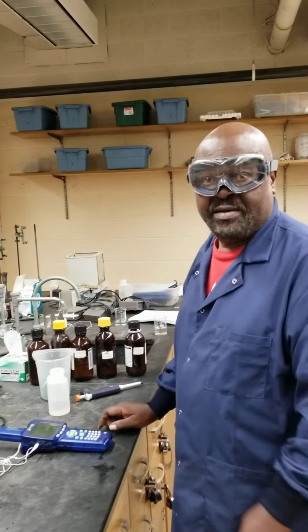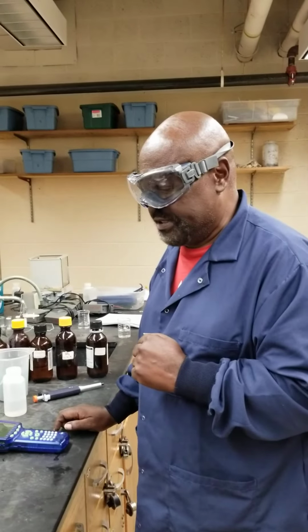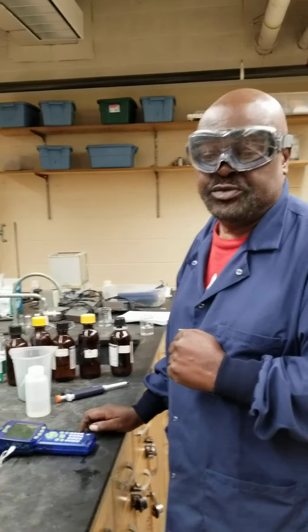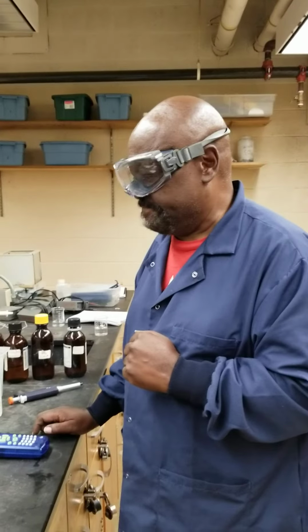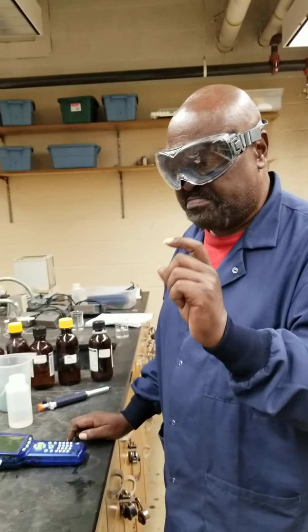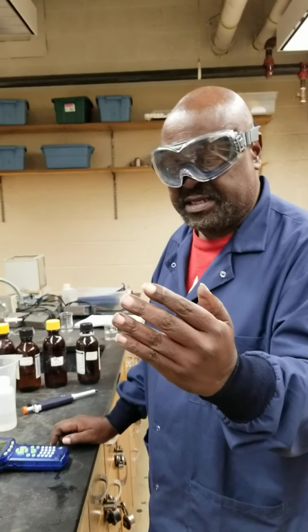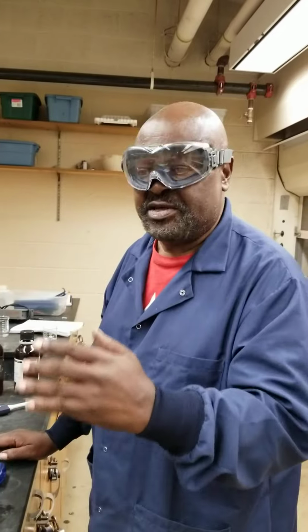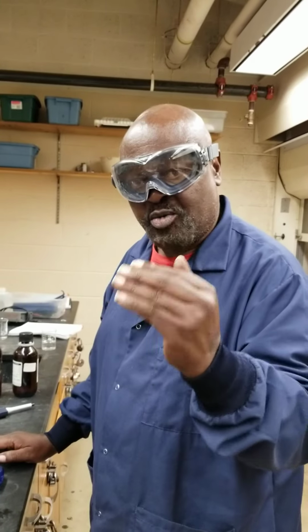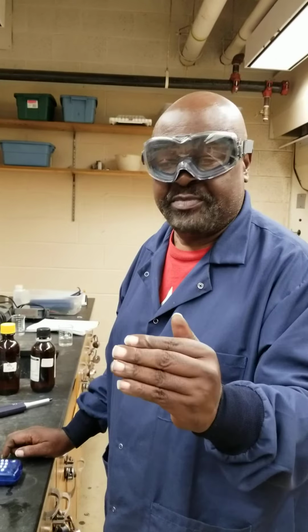Right, welcome to lab number 7. We want to determine the Ka values for acetic acid, sodium acetate buffer. We're going to have both the acetic acid and the sodium acetate in there, and measure the pH. We will know how many moles of each were added, M times L.